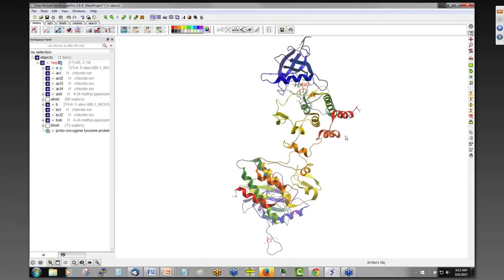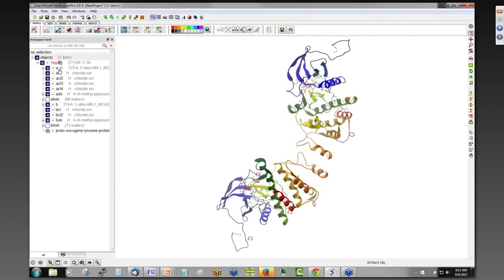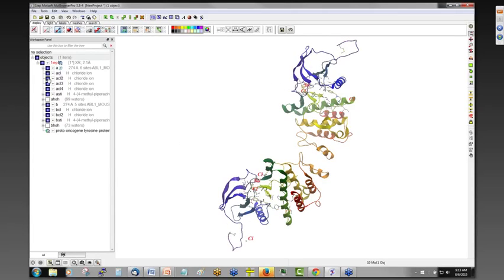Okay. And so you'll notice that in the left-hand panel we have all the information that we need about this structure. And so we can toggle certain molecules on and off that we're not interested in. So you can see it's an X-ray structure, XR is for X-ray, it's 2.1 angstroms resolution. We have one protein chain, A protein chain, and a B molecule here. And these are all the molecules that are related to that A chain. So there's a chloride, there's 1, 2, 3, 4 chloride ions in that structure, along with a ligand, Gleevec.